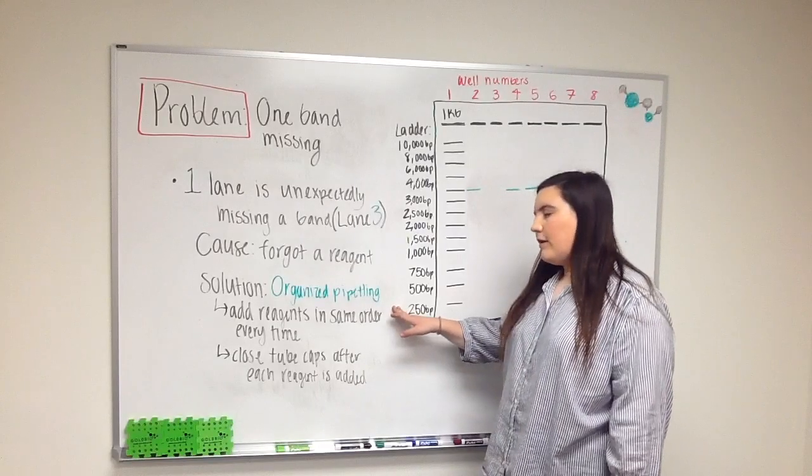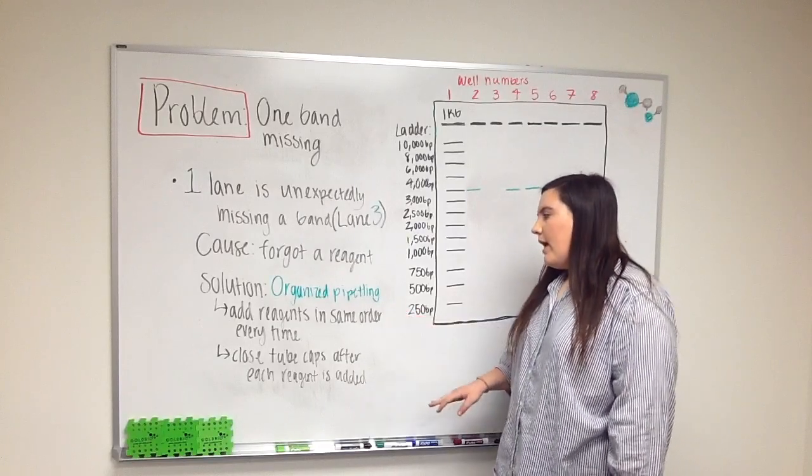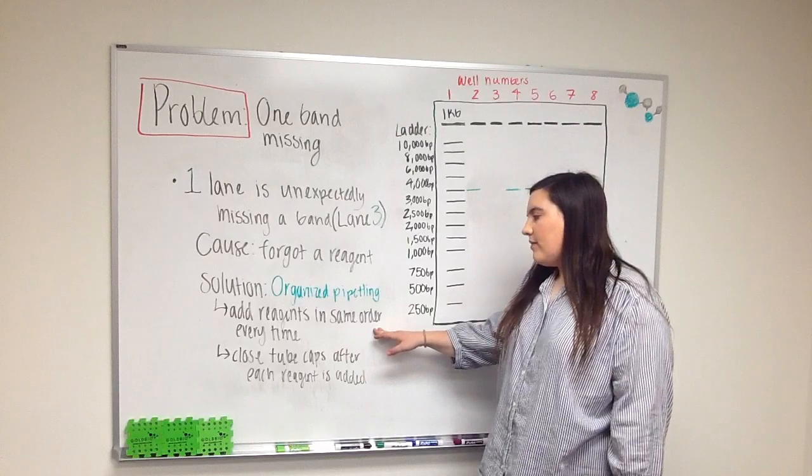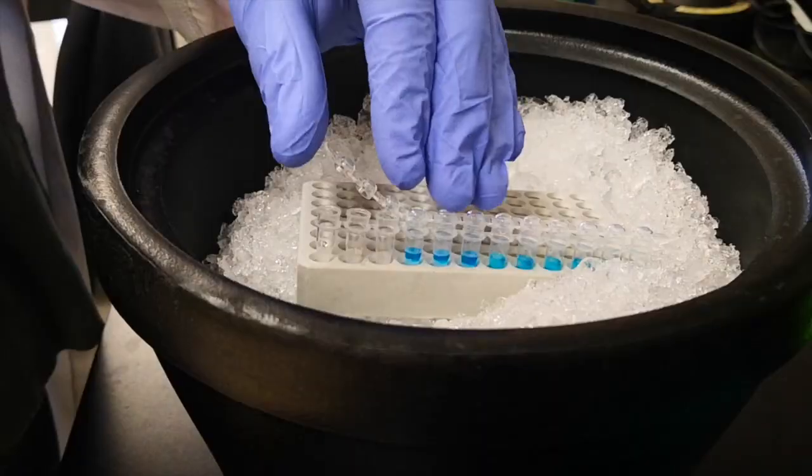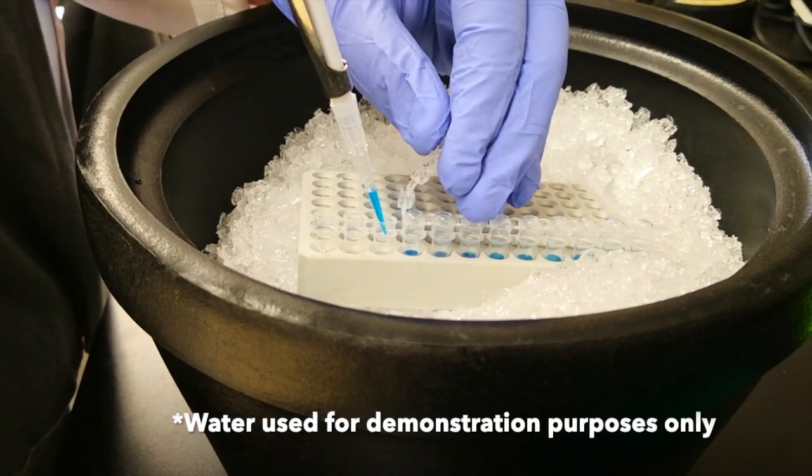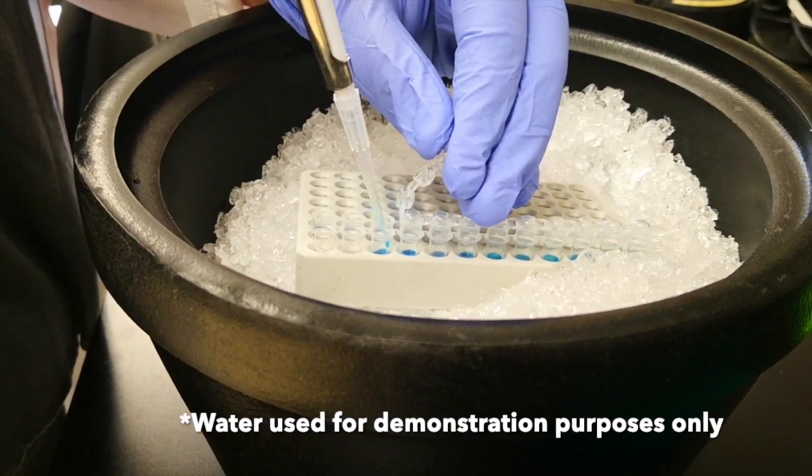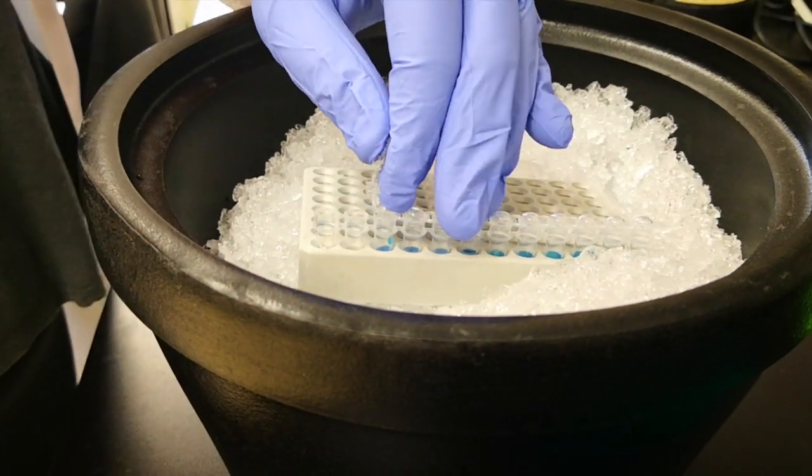A good solution would be to use organized pipetting. Try adding reagents in the same order every single time you do a PCR. Also, be sure to close the tube caps after you add each reagent so that you know that you already pipetted into that tube.